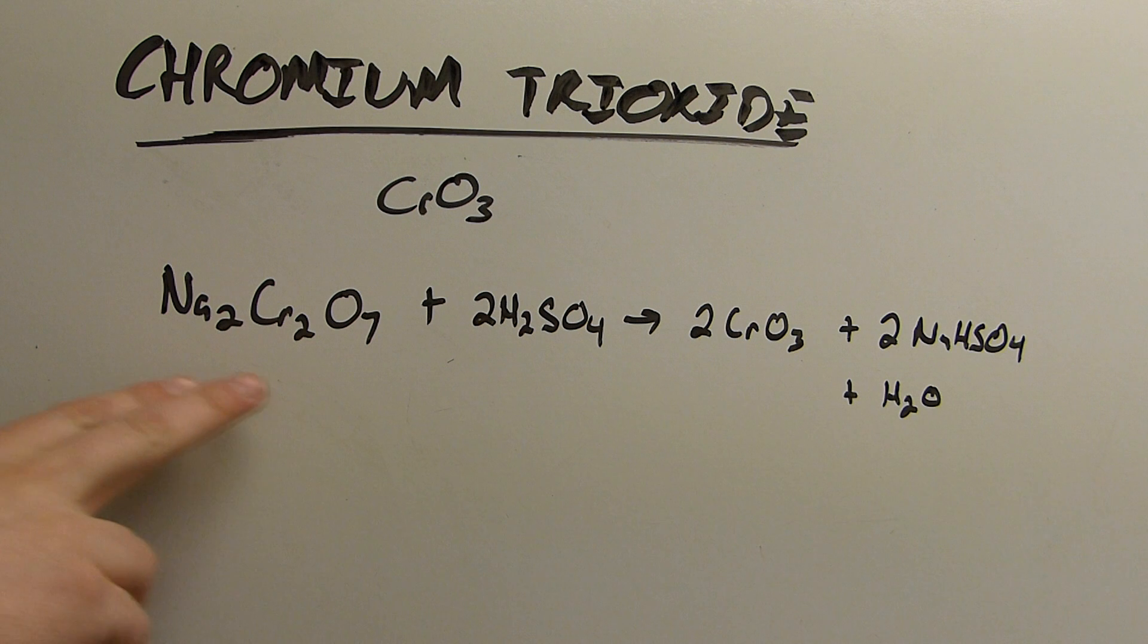I'll be making the chromium trioxide by reacting or rather dehydrating chromic acid by reacting sodium dichromate with sulfuric acid to form the chromium trioxide which precipitates and sodium bisulfate in water.